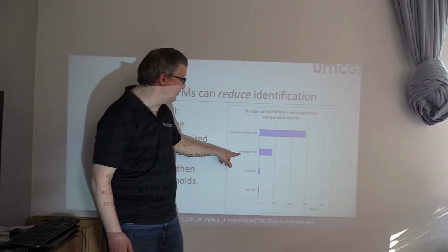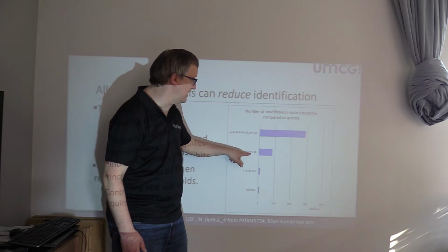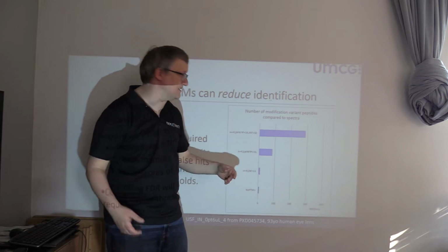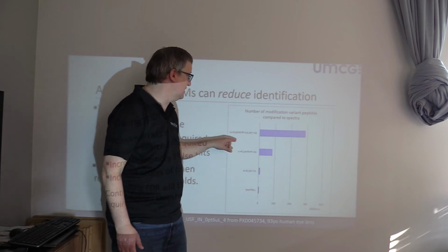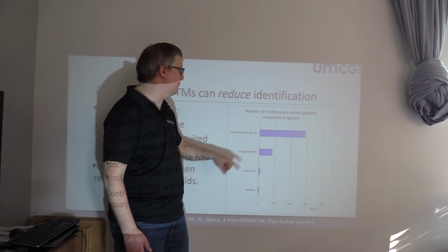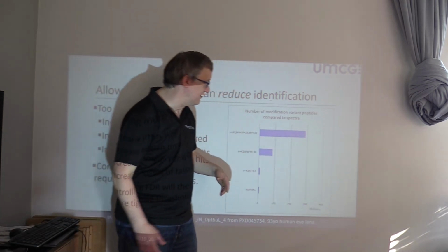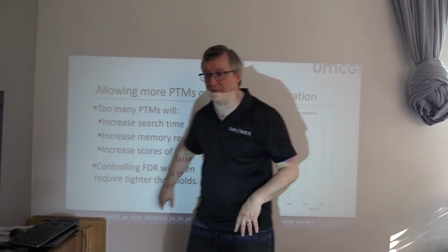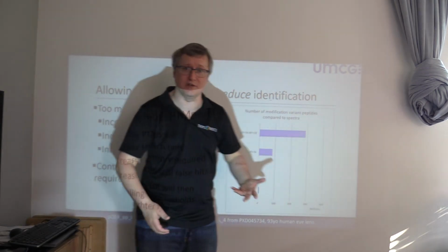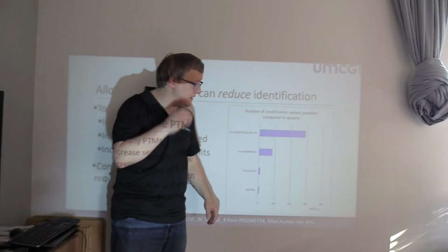But now, as we add in the possibility that methionine, tryptophan, tyrosine, and proline may gain 16 mass units, well, our search space has grown dramatically. And if we add on top of that double modifications, double oxidations, we see that the number of possibilities has grown and grown. The sample I'm considering here is not a phosphorylation search. None of these were the STY plus 80 mass shifts.